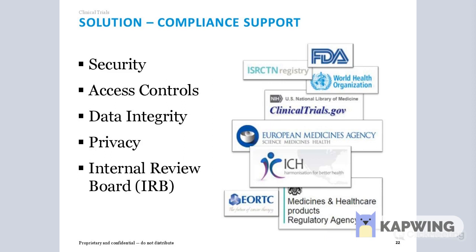Data integrity must be maintained to ensure compliance with all major regulatory agencies and acts, including FDA, CLIA, NIH, and HIPAA. All sample movement transactions and changes must be tracked for easier auditing.